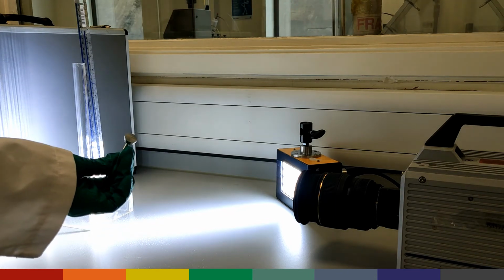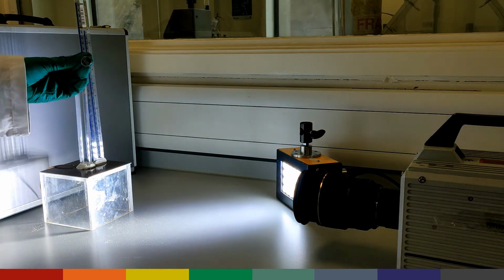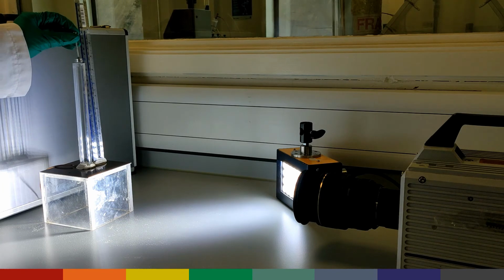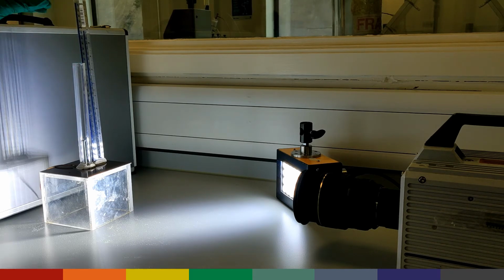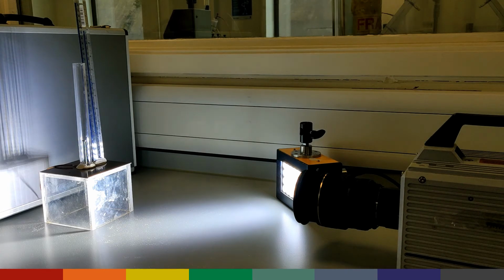But this time, we have both the light source and the high-speed camera ready to capture the glorious moment of when the SEM stub and the base meet. Don't blink your eyes, here we go. Well, maybe it's not that fun to look at after all, but nevertheless, we can extract a lot of information from the high-speed video that we just recorded.